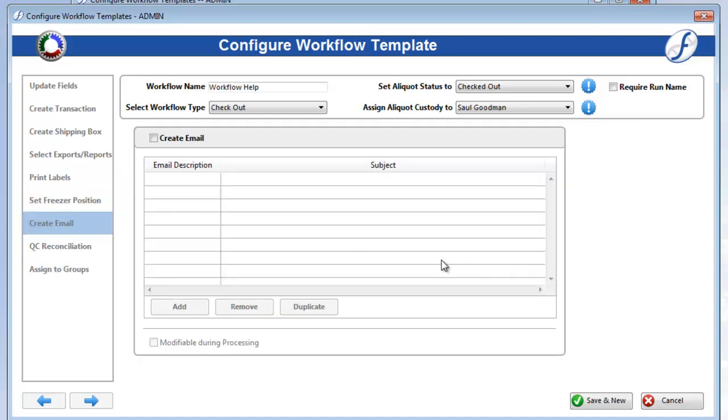The Create Email page will only be available if you are using Freezer Works Client Server and have properly configured emails and system properties. Check on Create Email to activate the tools below.